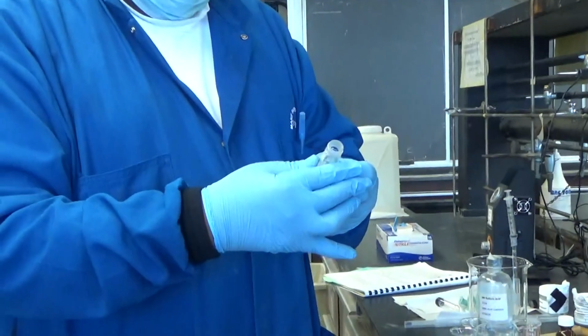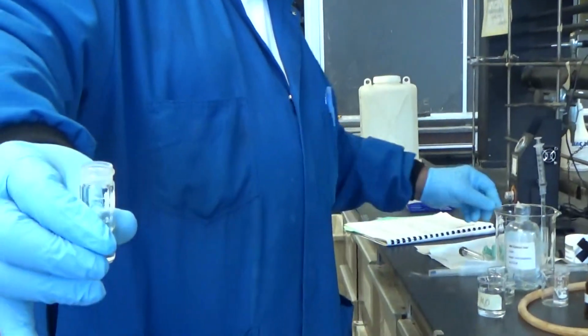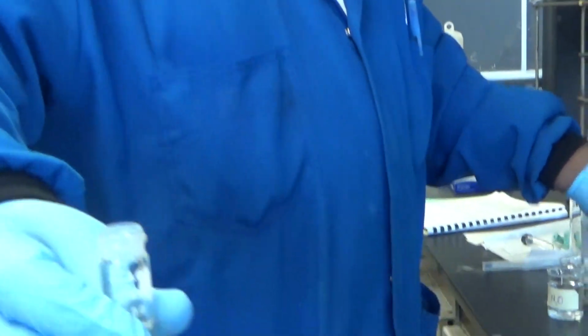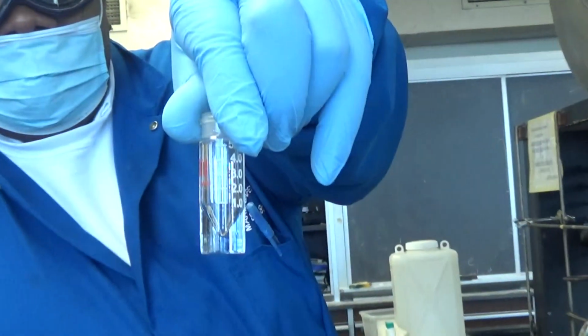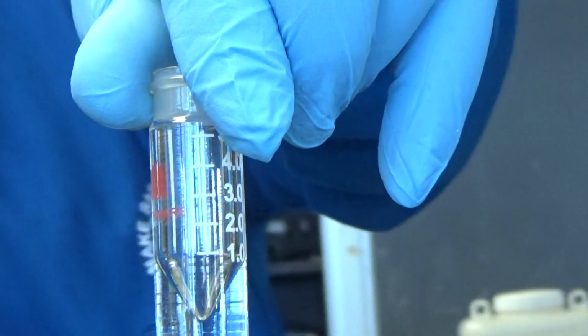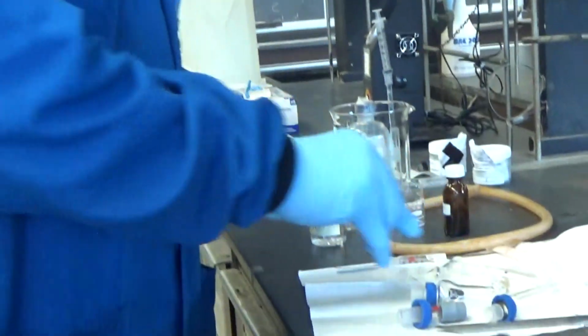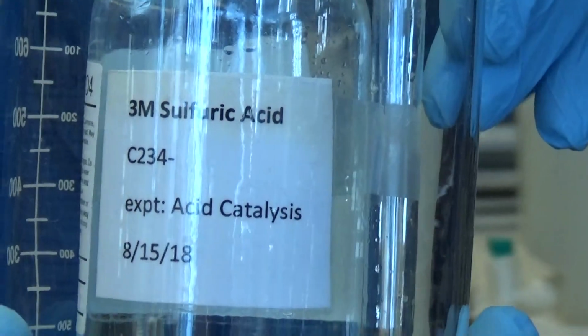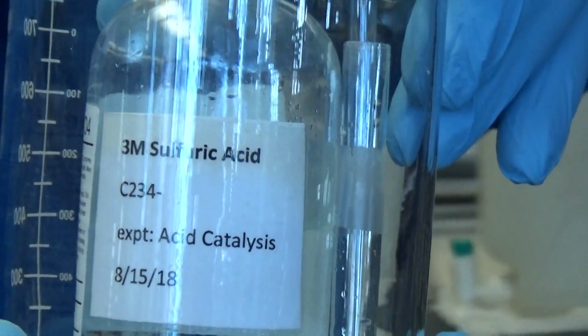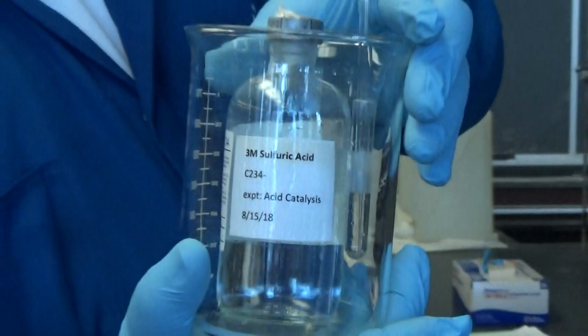We need a 5 milliliter conical flask. Yeah, it's a 5 milliliter conical flask. And we need 3 molar sulfuric acid, H2SO4.